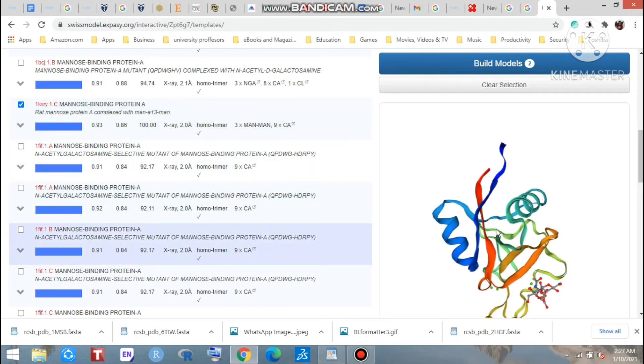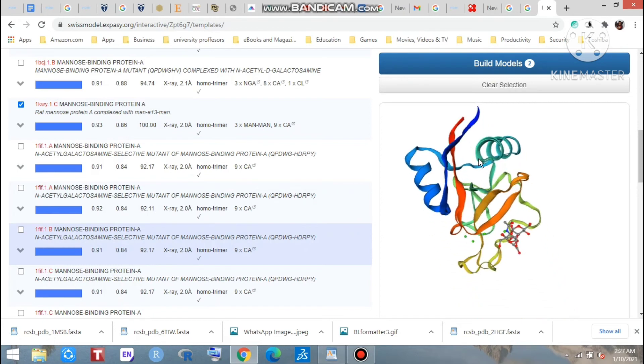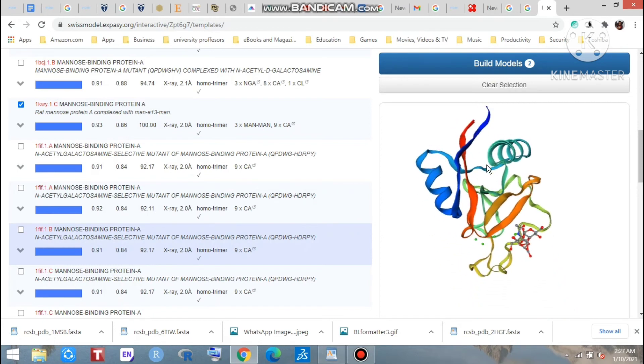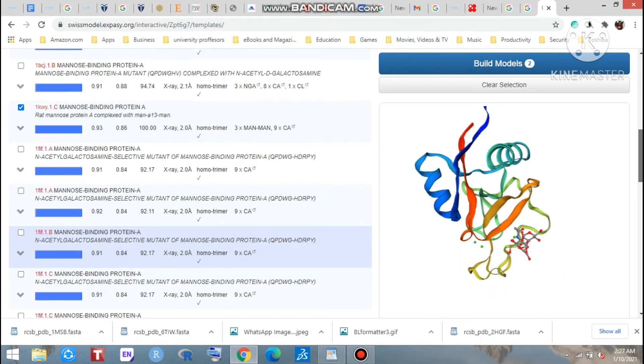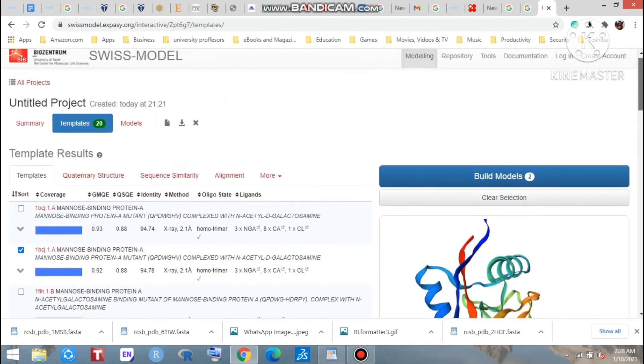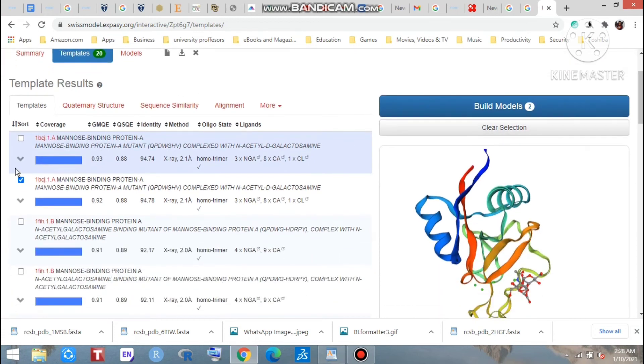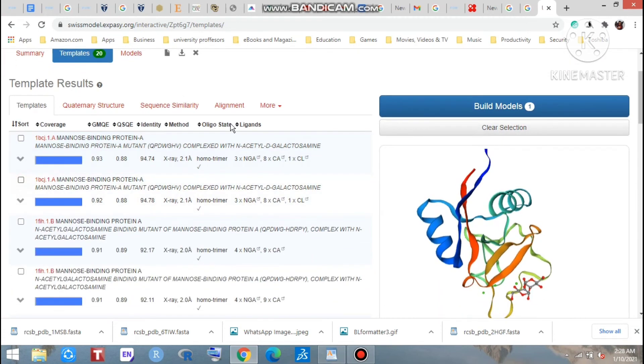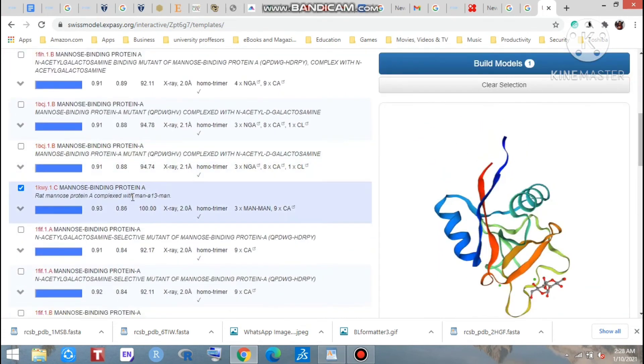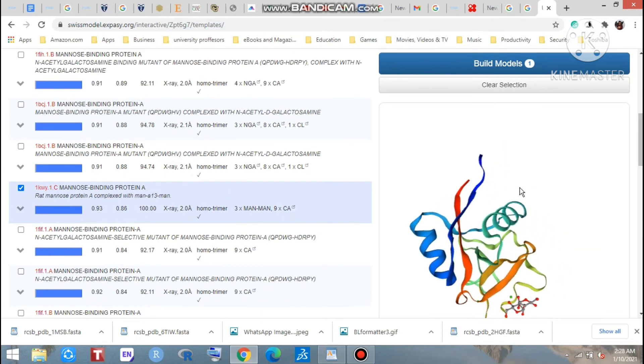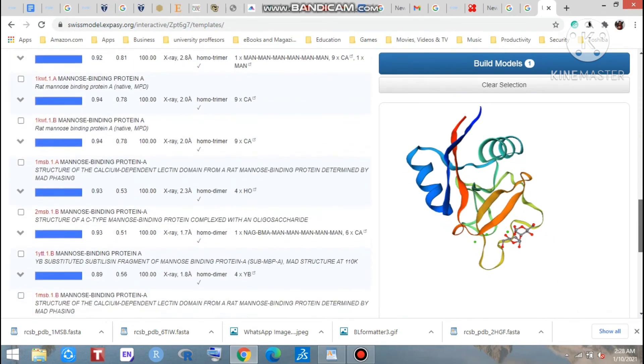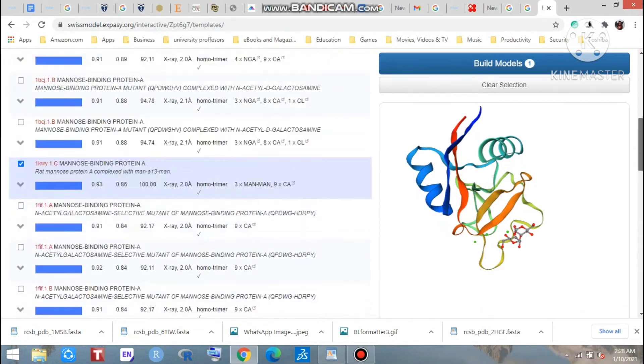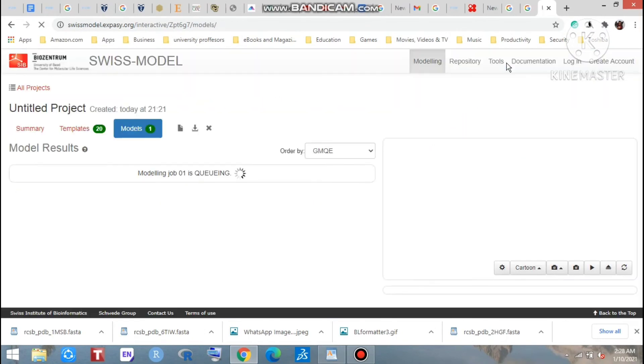Look at that, there is showing here a 3D structure of this. Now what can we do? Now we have to click build model. Now as we select this one only, you can see the 3D structure of this template. Okay, just click here as build model.